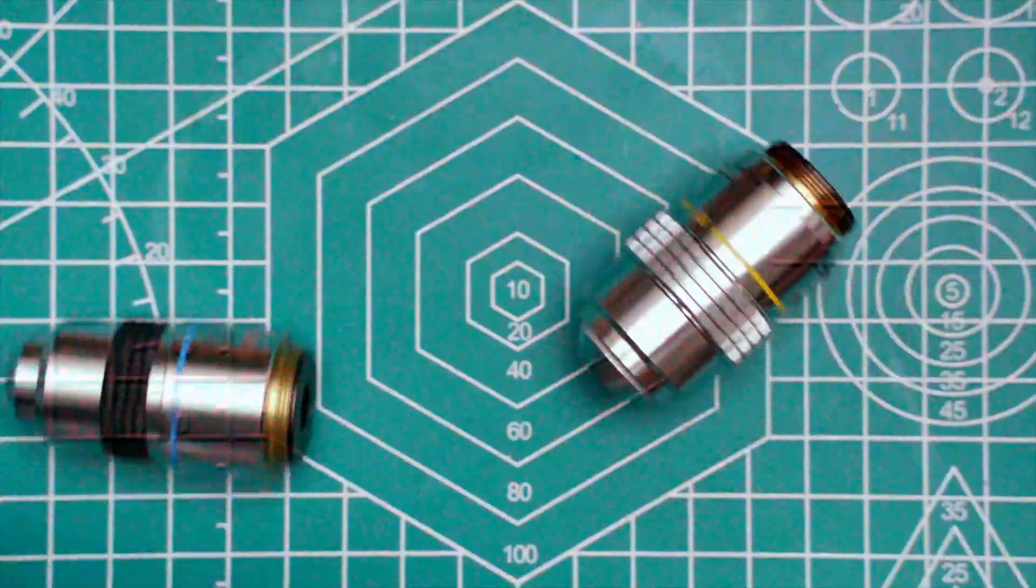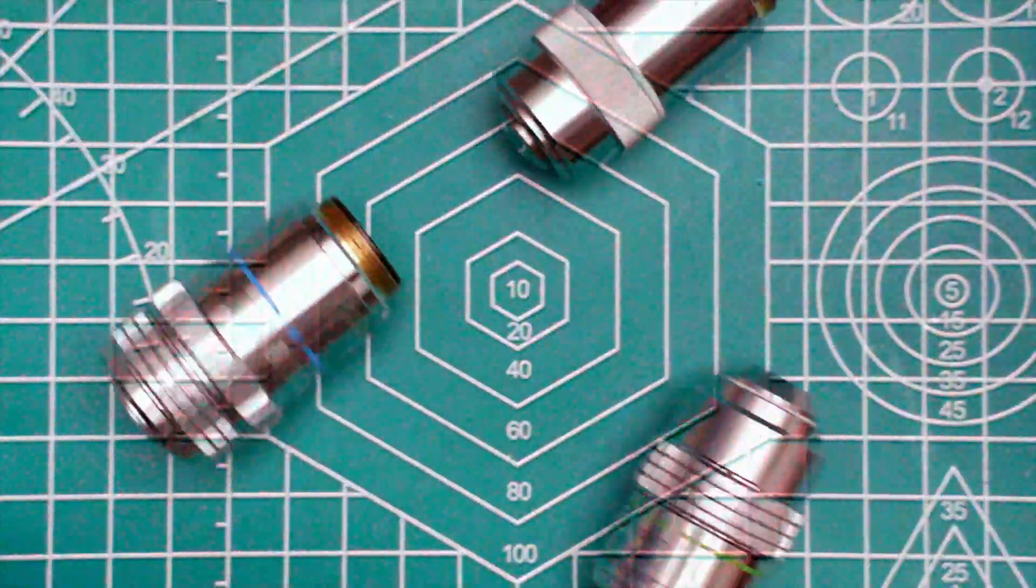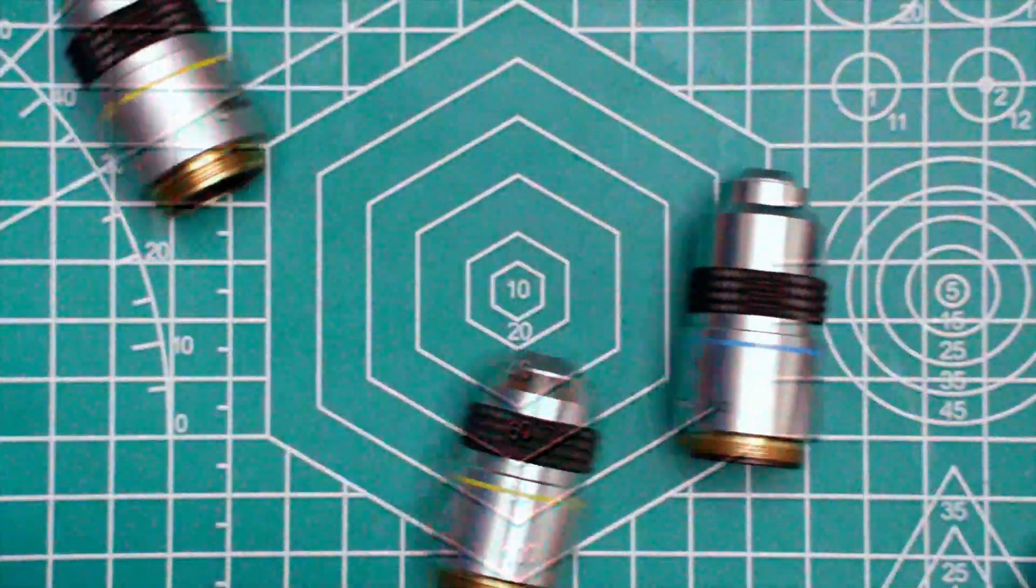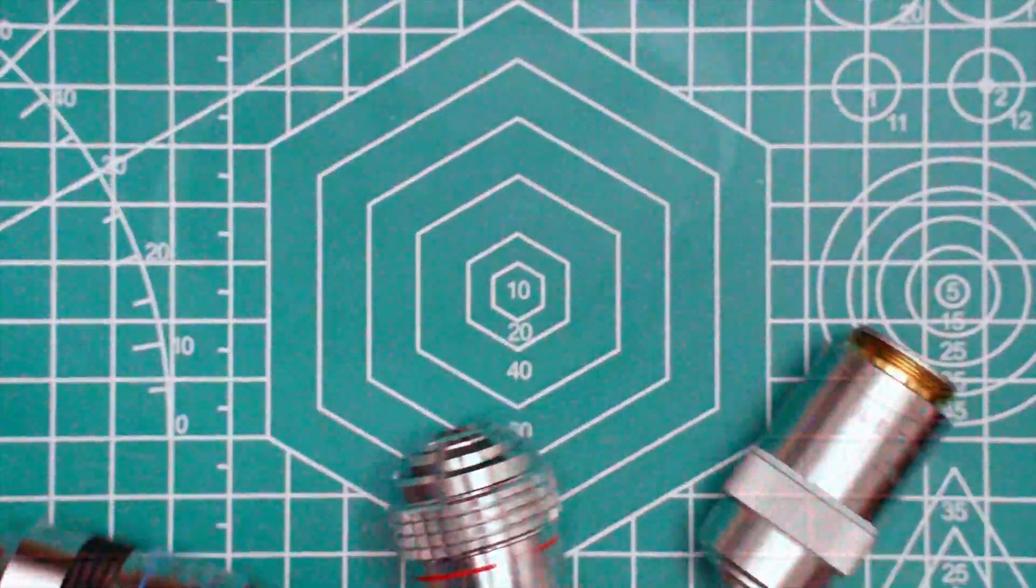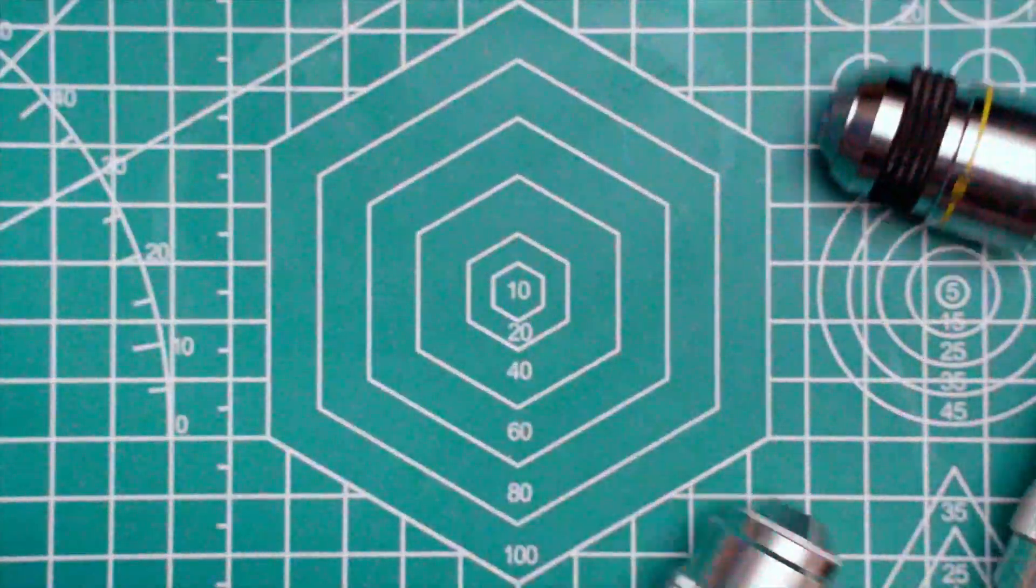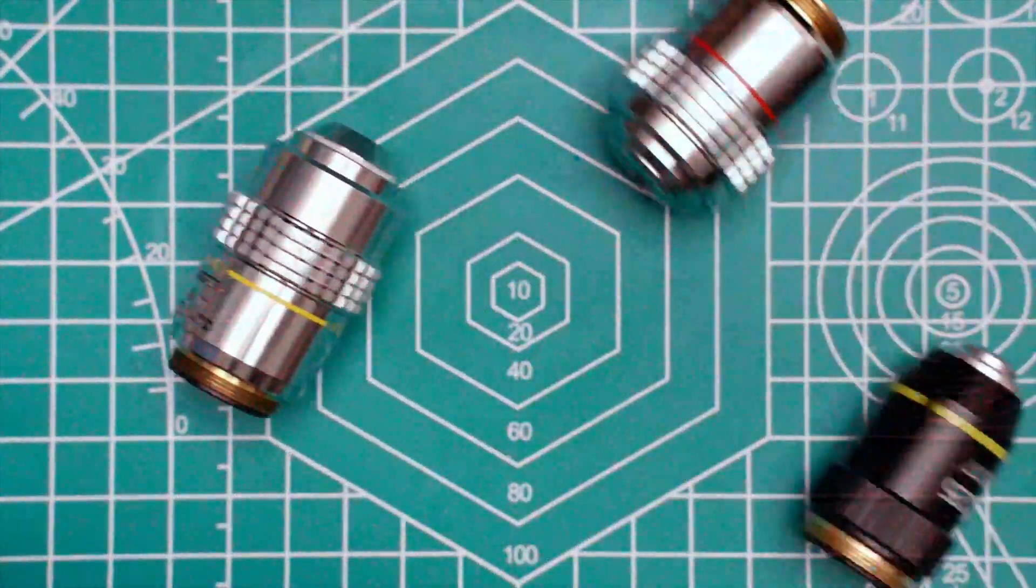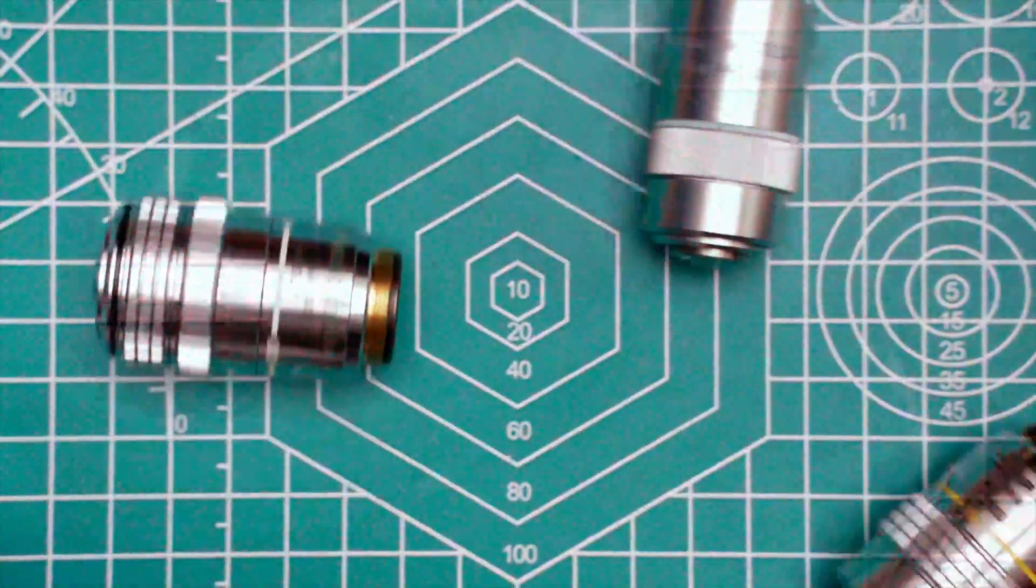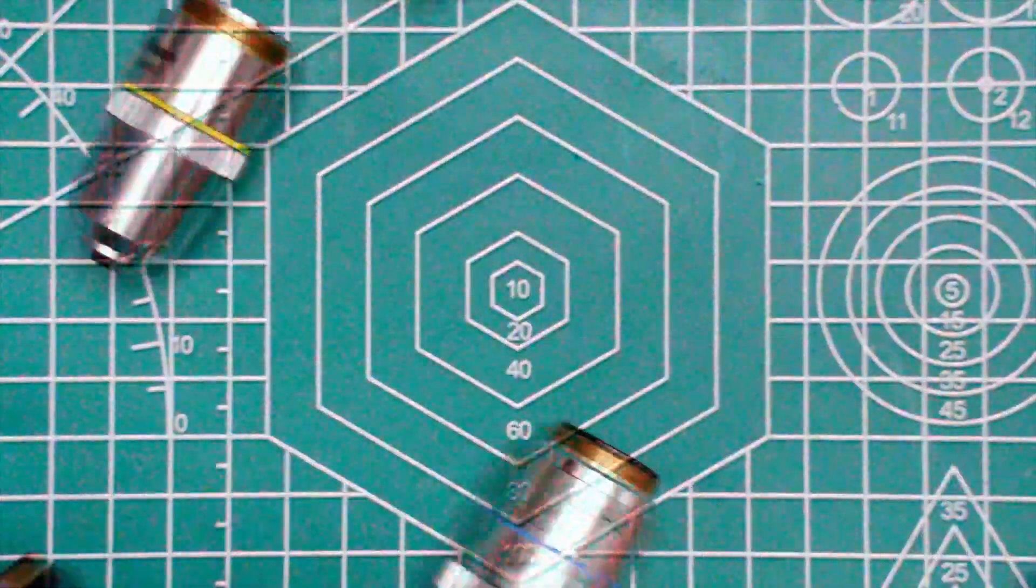Okay, wow. There are a whole bunch of these things, huh? Different shapes and vintages and designations, manufacturers. My goodness, how can you know what's right for you? Well, there's no way to fully cover all the nuances of objectives in a single YouTube video.